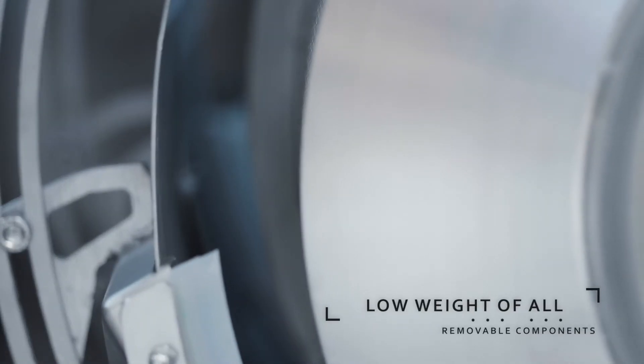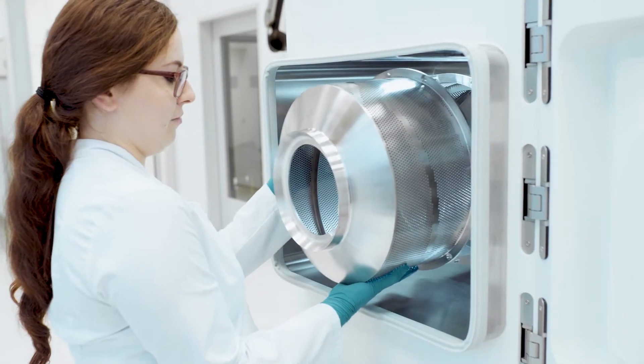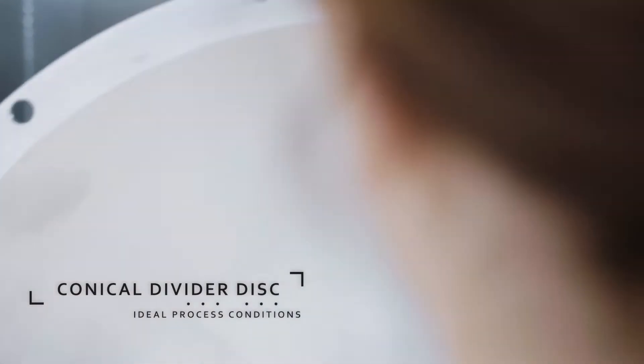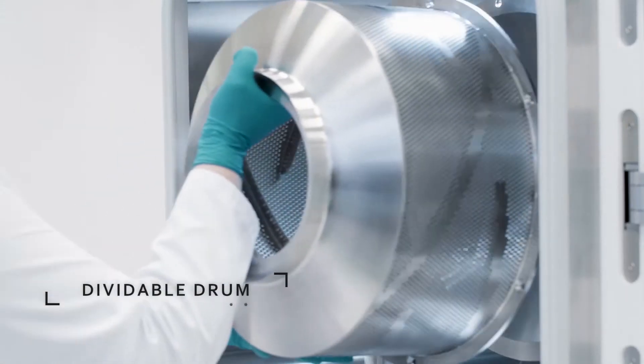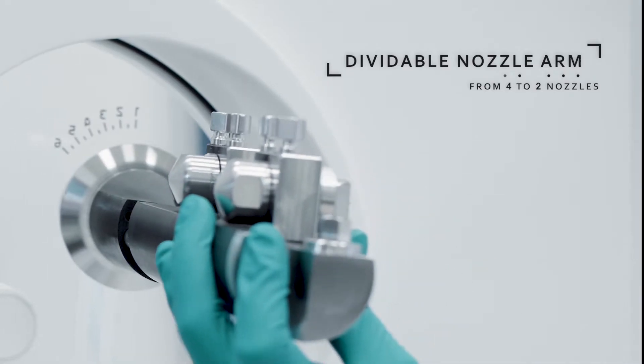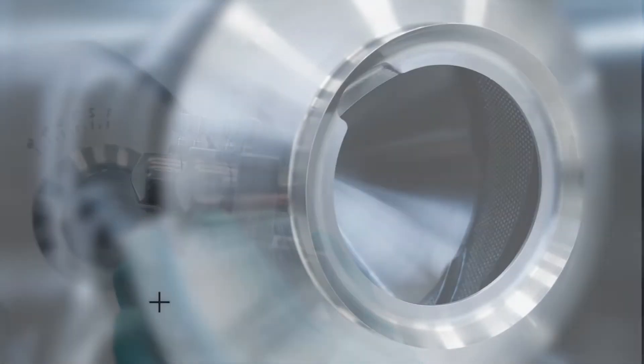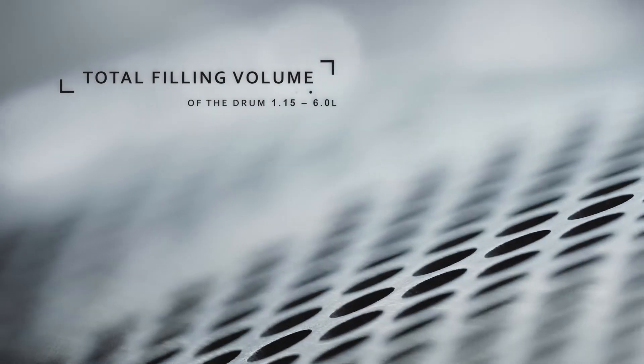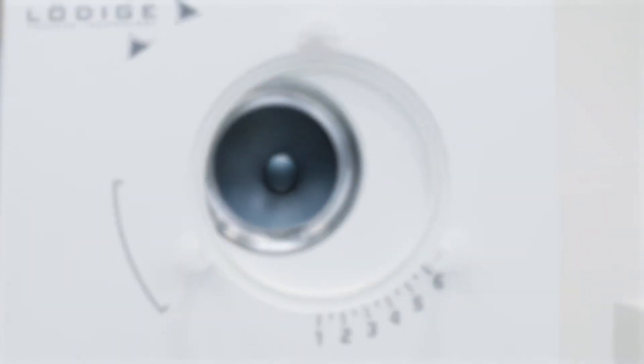All removable parts are characterized by a very low weight. The sophistication of the LC Lab design is reflected by the dividable drum. Together with the nozzle arm, it can be divided in two, making it possible to film coat volumes starting from 0.6 liters. This advantage pays off in the long run, particularly for expensive materials.